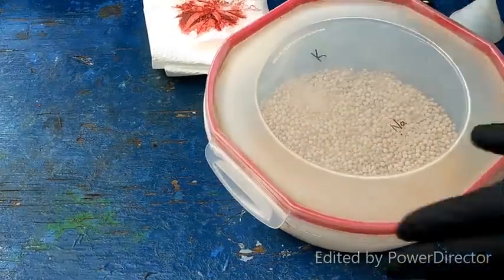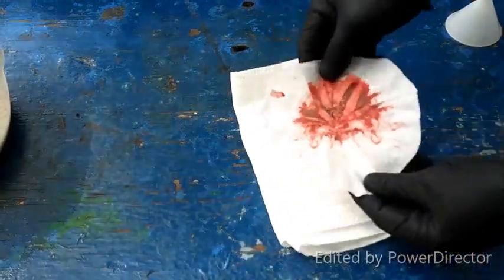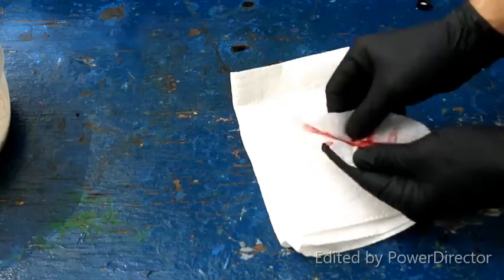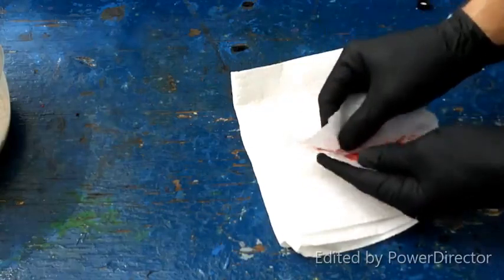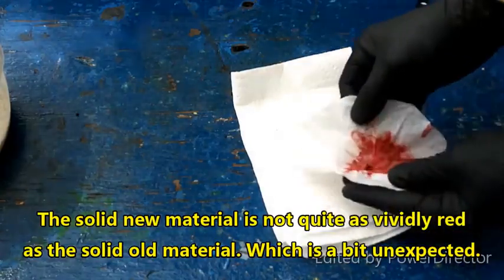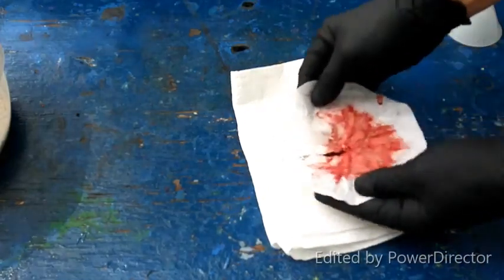Those are just 3 angstrom molecular sieves. Make the best desiccant I've ever seen. Alright, so there is our dried uranium red. Remember, this was made exactly the same way the stuff we just made was. Gonna get it all ready to bottle up here. Looks very, very much like the material we had last time. I want to be extraordinarily careful about dust. Dust is not good.